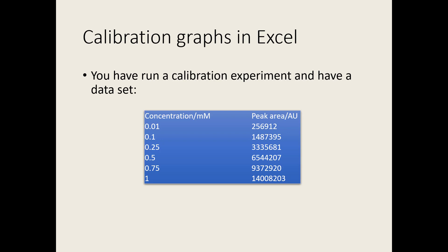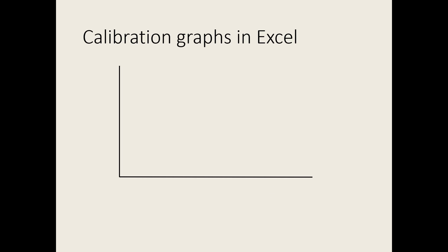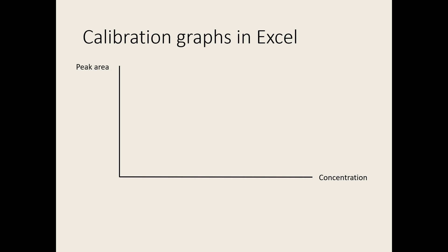How do we go about obtaining a calibration graph with its linear regression equation and R-squared value? The independent variable, or what you control in the experiment, is always plotted on the x-axis, in this case concentration. The dependent variable, or what you measure, is plotted on the y-axis, in this case peak area.